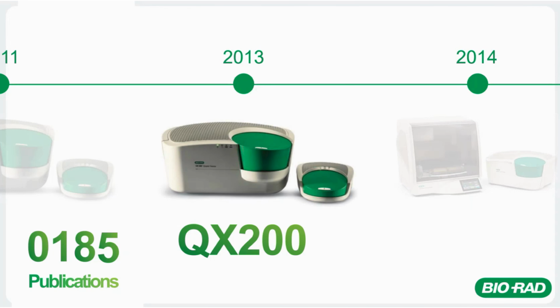But also, because the technology is labeled specifically ddPCR, it means that anyone running ddPCR is running it on a Bio-Rad system. What does that mean? It means that if you have some sort of study you're looking to run, maybe you're looking at tropical infectious diseases, you can type in ddPCR, tropical infectious diseases, either on Google or something more specified, and you're going to get publications where people who are running the same system as you generally publish things like their primers and their probes, and you can start to understand how the technology can benefit you.